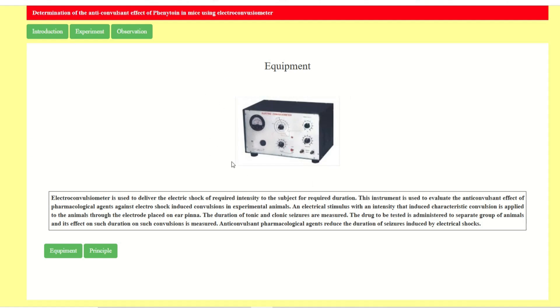The drug to be tested is administered to a separate group of animals and its effect on such convulsions is measured. Anti-convulsant pharmacological agents reduce the duration of seizures induced by electrical shocks. We will use this instrument to deliver measured intensity of shock to the mice for a specific duration, to induce convulsions or seizures. There are two groups: one dosed with saline and another dosed with the anti-convulsant drug phenytoin.